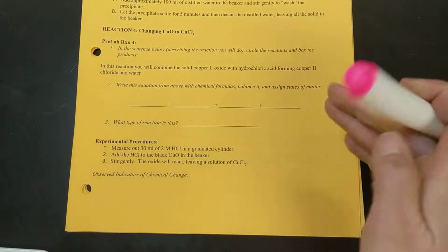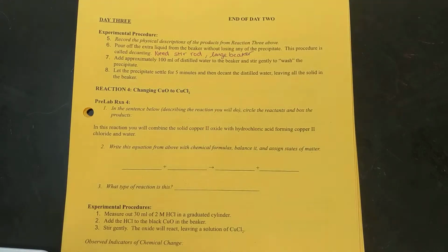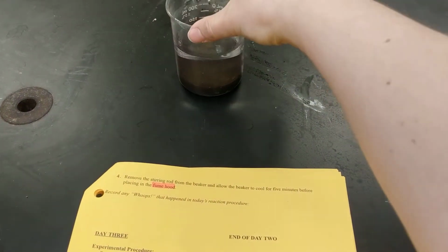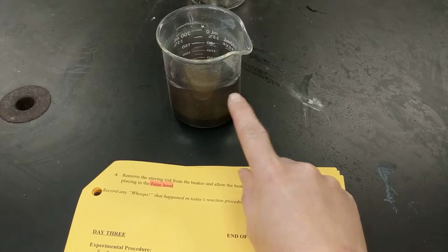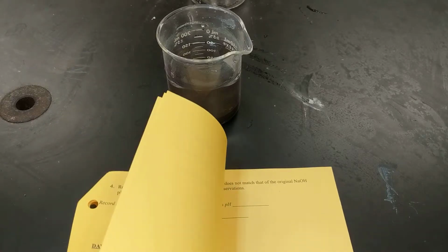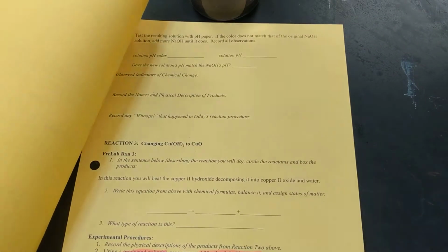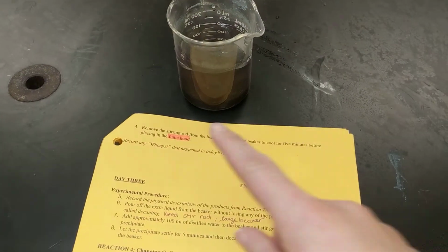For our experimental procedures, we'll notice that we have some pre-work to do before we can actually start getting our copper oxide. If we look at our beaker, it has our copper oxide as solid at the bottom, so down here is our solid copper oxide, and then above it we have the liquid left over from last time. If we check back, from our reaction, we made copper 2 oxide and water. So that top part of our beaker today is just water that's hanging out there.